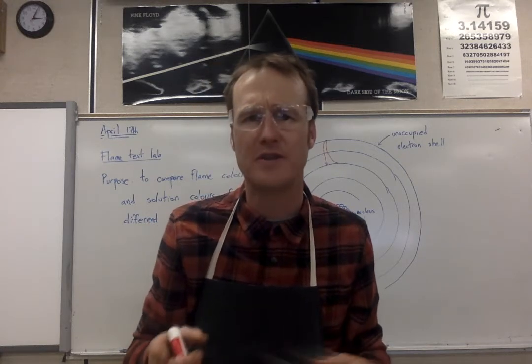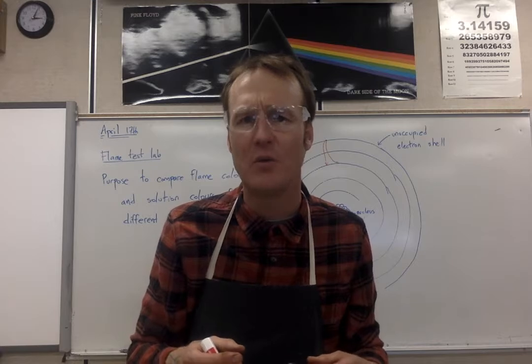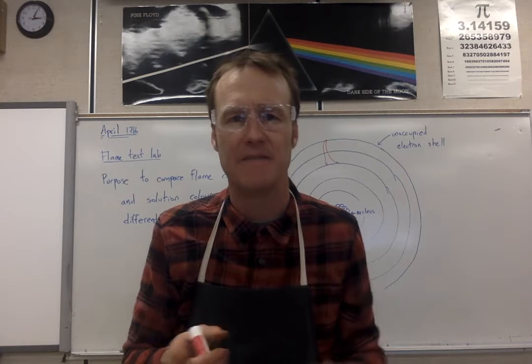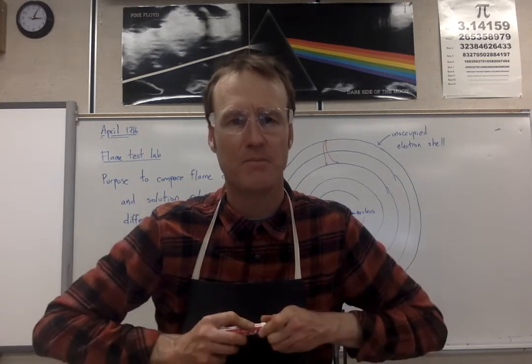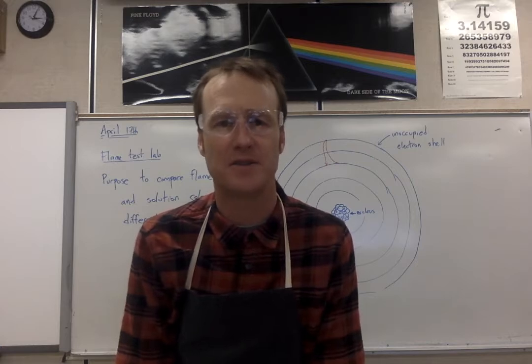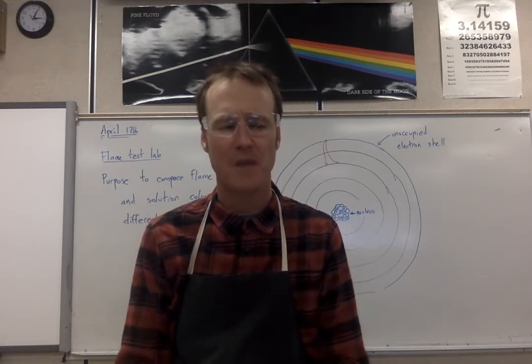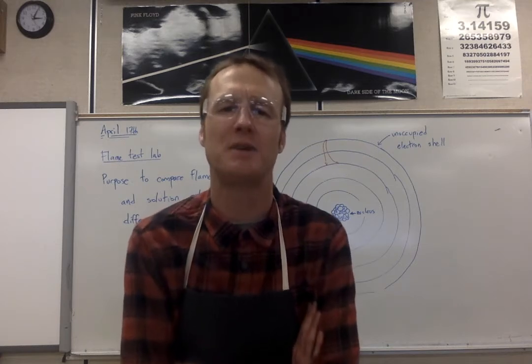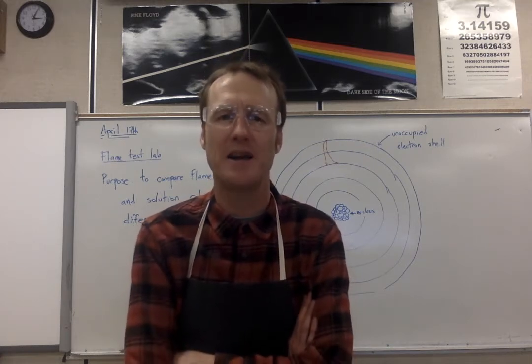Now, where does that figure in when it comes to what we're going to do today? I'm going to show you flame tests for several ionic substances of metals. I changed the design a little bit of what's expected in the textbook, and I added some stuff to it.